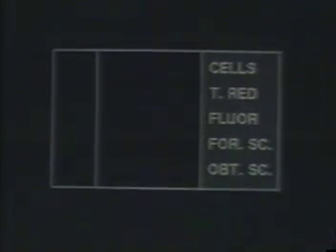A collection label has three separate parts. On the far right side, the cell and sensor headings from the protocol are listed for reference purposes. This column cannot be edited and is the same for every label in this drawer. The center column lists the contents of the sample as described by Tom in the protocol. Note that each reagent is listed across from the fluorochrome with which it is associated. The leftmost column of each sample label is reserved for FACS users to tell the Secretary how many cell data points to collect per sample and how the amplifier gains are set for each FACS channel.